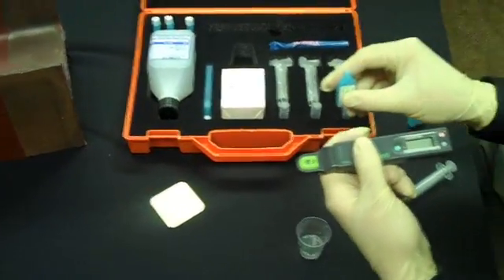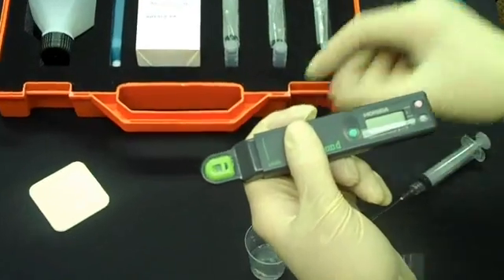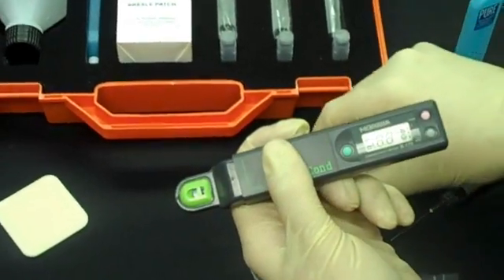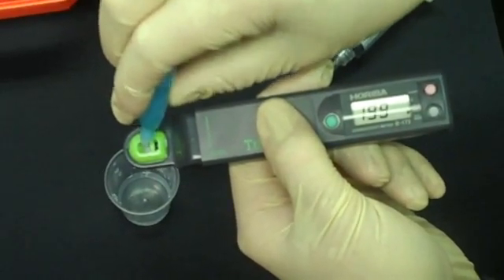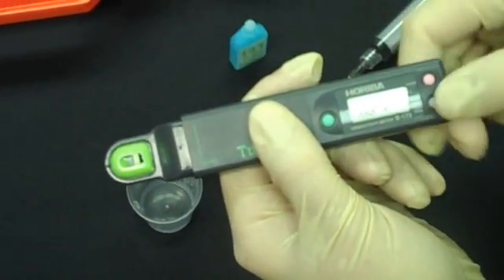To do so, the kit has a calibration solution. Just turn the gauge on, insert a few drops of the solution into the sensor area, and press CAL.